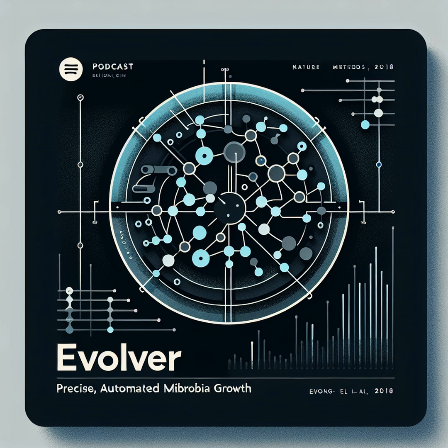I'm your host, Matthew. Today, we'll delve into a groundbreaking paper detailing eVOLVER, a DIY platform for high-throughput automated cell cultures. This research tackles the challenge of balancing precise control over experimental conditions with the scalability needed for large-scale studies in fields like molecular evolution.